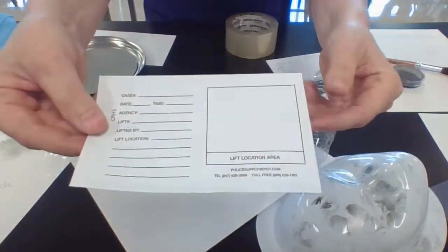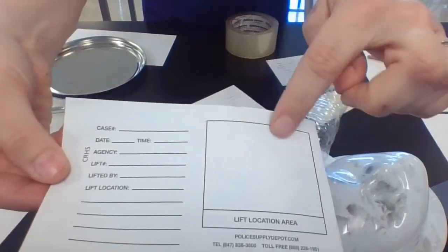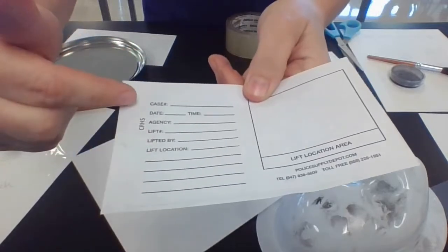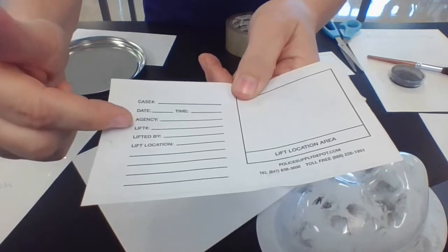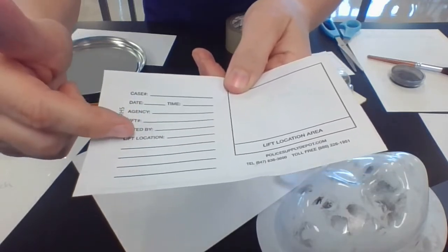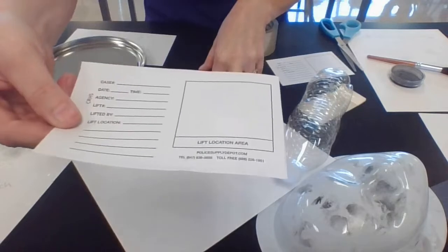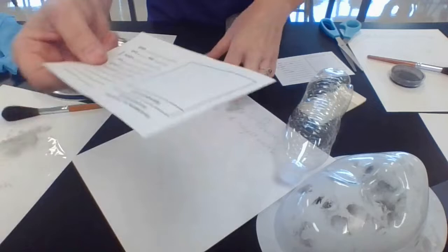On the other side is our evidence incident log. We're going to sketch out what this evidence looked like and where this print was on our evidence. We jot down our information: the case number, date and time, agency, the person who lifted it, the fingerprint number, the lift number, the location of the lift, and the sketch orientation. This then goes into an evidence bag to maintain chain of custody. Seal that evidence bag, fill it out, and sign your name along the seal.